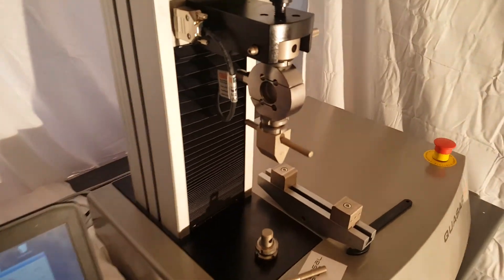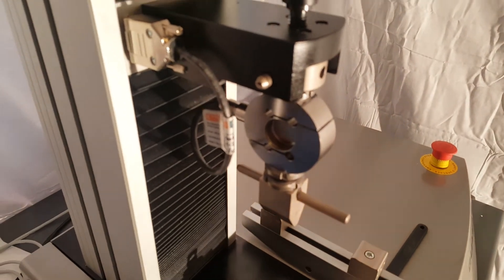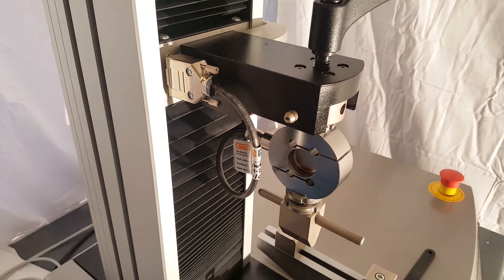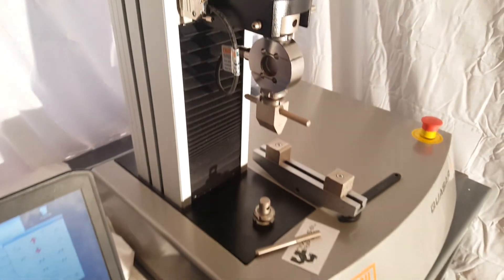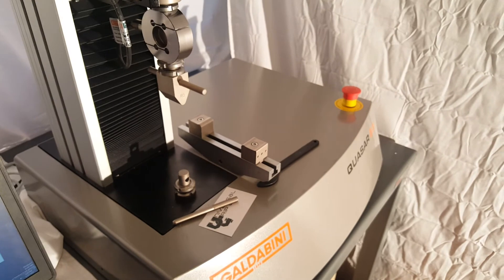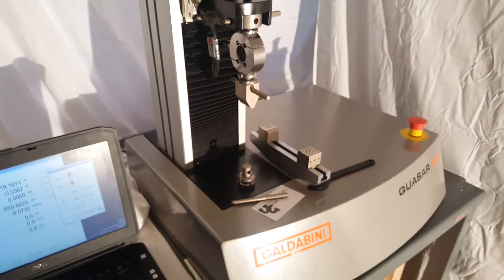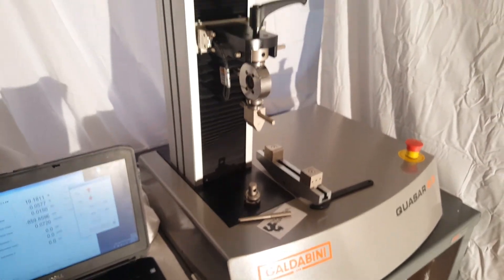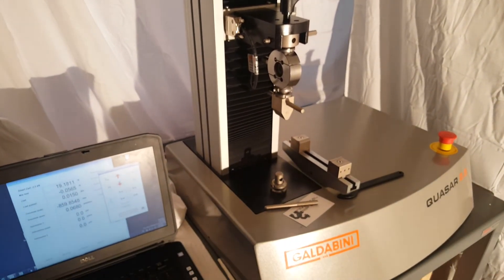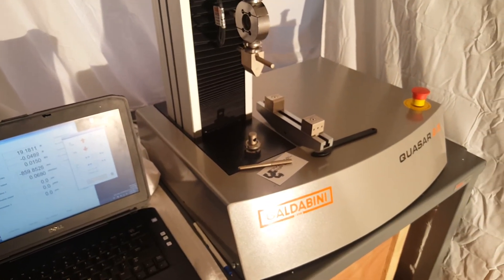One of the things I really like about this machine is that the load cell connects directly into the crosshead. So it's a real easy setup — there's not a whole lot of extra cords or wires going everywhere. It's designed to work right out of the box with some simple installation, and you can get up and going in about 15 to 20 minutes or so.